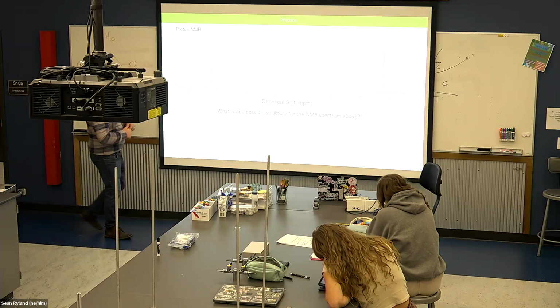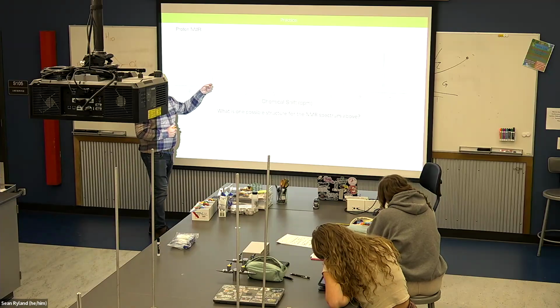So you really see it look like a mess when you have an odd number of them, because then you wind up with all those different peaks on top of each other.